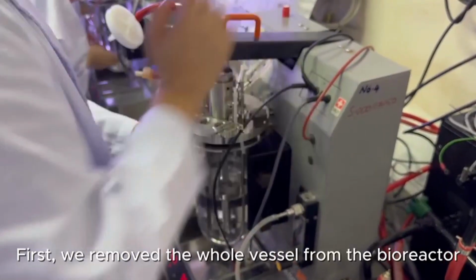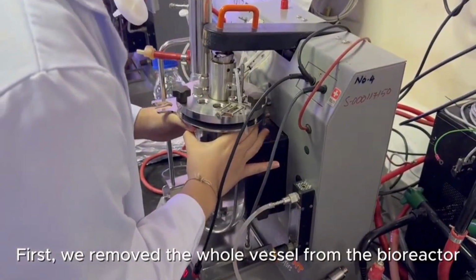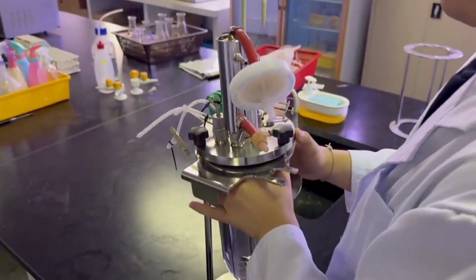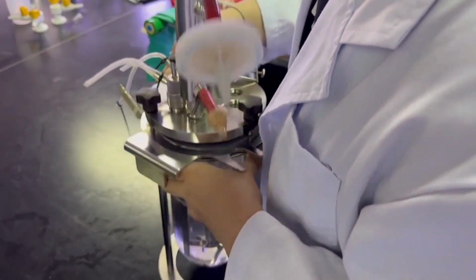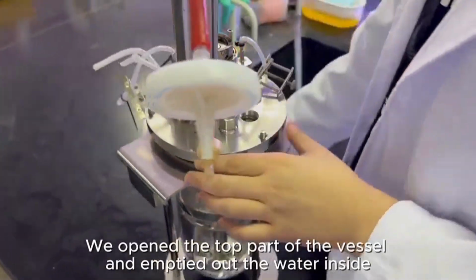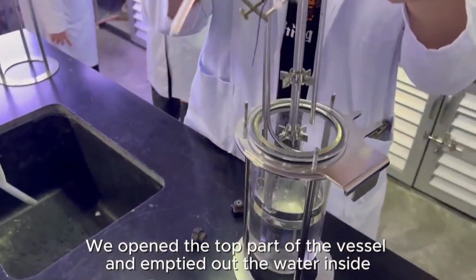Step 1. Vessel removal and medium preparation. First, we remove the whole vessel from the bioreactor. We open the top part of the vessel and empty out the water inside.